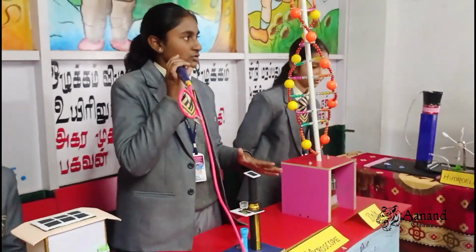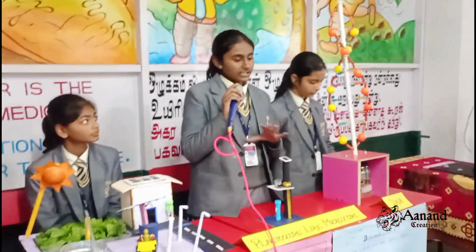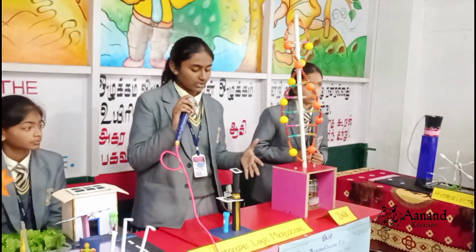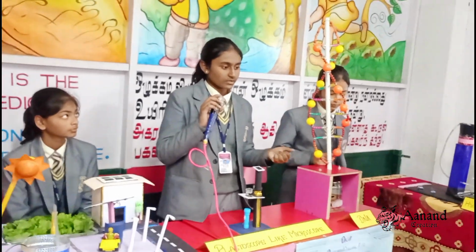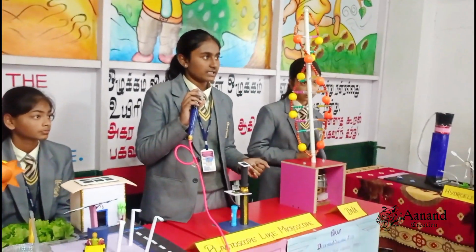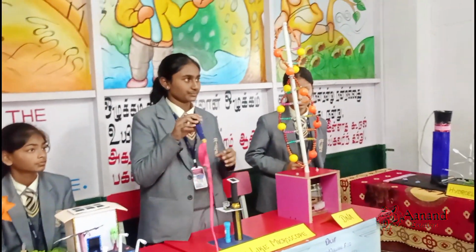So this is how a microscope works. The advantages of a microscope: it doesn't occupy much space, it is inexpensive, it can be used at home, it is made from materials found at home, and it is used to find more diseases. Disadvantages: no longer lifespan, and eyes are affected. Thank you.